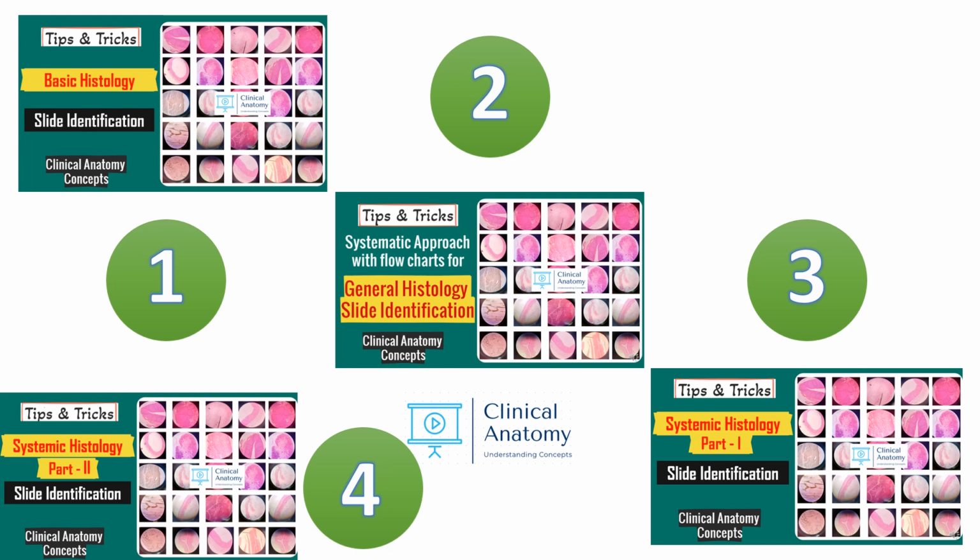If we watch 1 to 4, almost all the slides in our undergraduate slide identification, spotter and discussion, I have covered. So try to see them in the same sequence. In the first video you will mainly see the epithelium, then cartilage, muscle, everything, then part 1 of the systemic histology, then part 2, so that it will be easy for you to correlate. Here in the systemic histology I haven't said how to identify the epithelium, because everything is covered in the first and second. Okay, so quickly I'm moving to the topic proper.